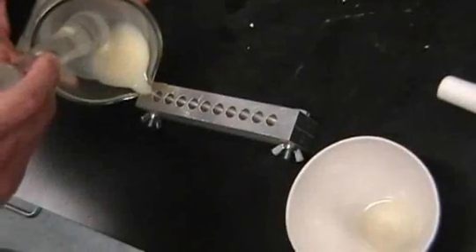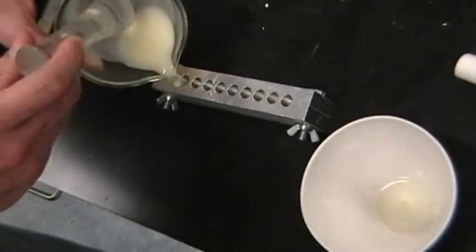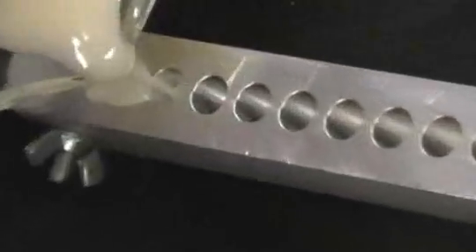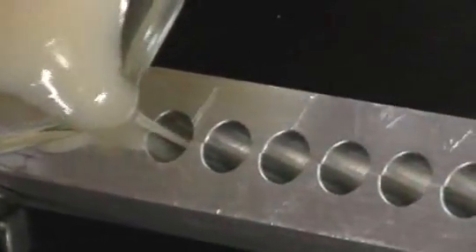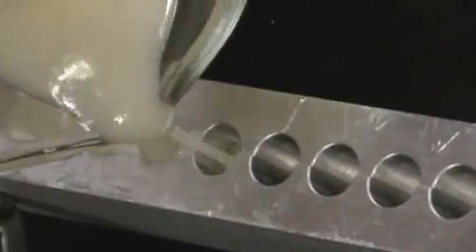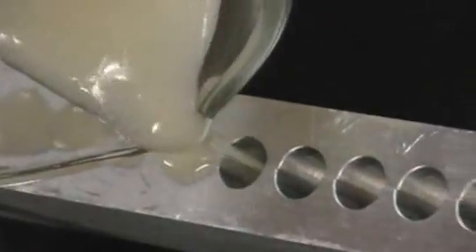Once it's completely mixed, take your cocoa butter or your PEG and start pouring it into the closed metal mold. You want it to overflow a little bit because then you're going to take a spatula and scrape the top off.